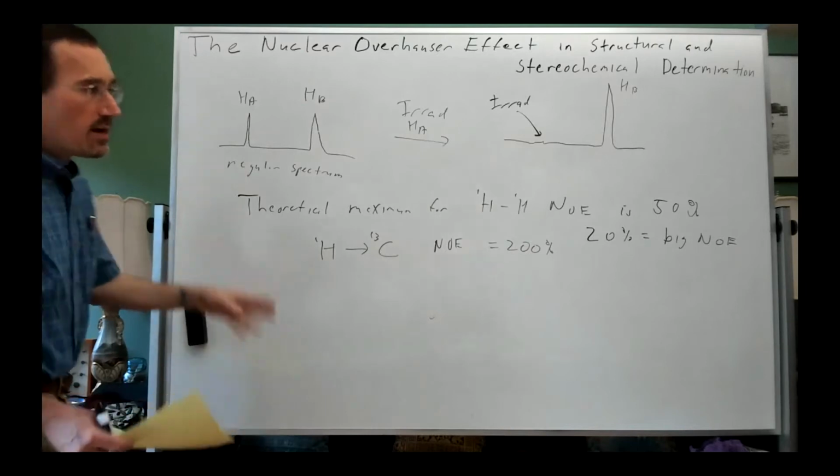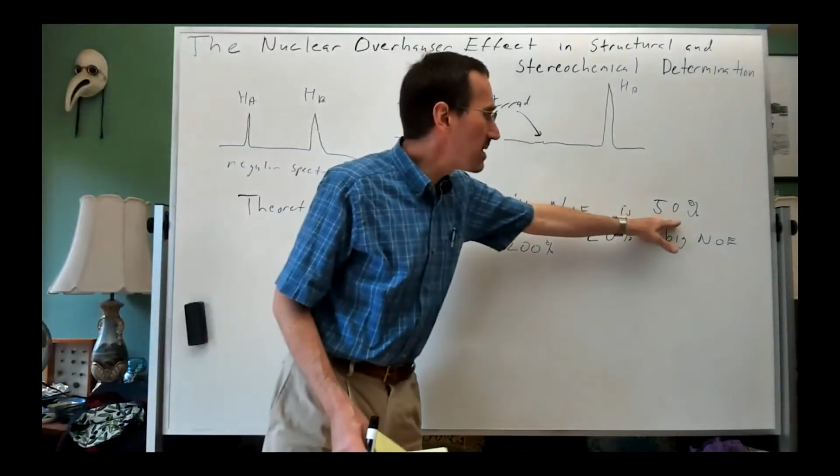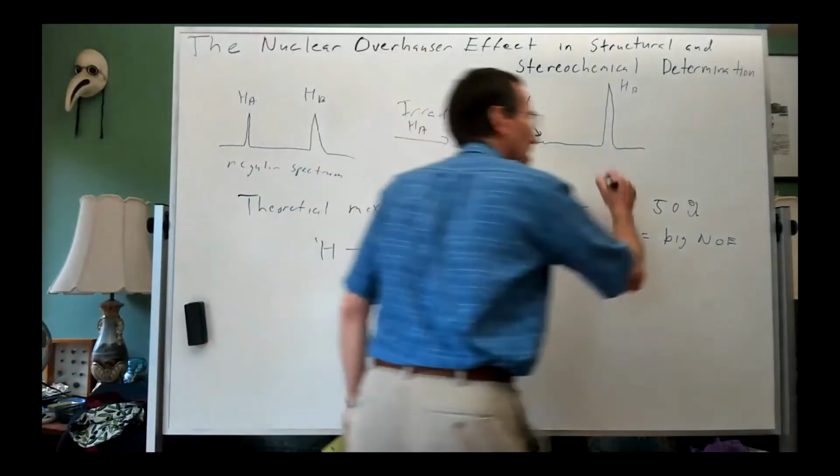NOEs can be positive, and this is the case with small molecules.